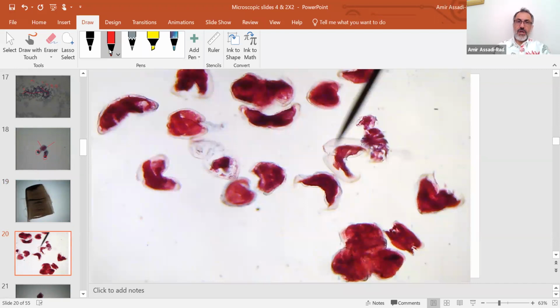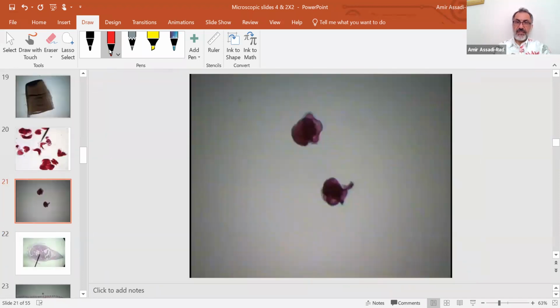These are your the one that attaches to the gills of fish and sucks blood, Glochidium. It's a larva stage. The name of the larva is called Glochidium, and they attach to the gills of fishes and suck blood. They do look kind of like veliger larva, but they are not veliger. Remember that. Okay, this is a veliger larva, phylum Mollusca.